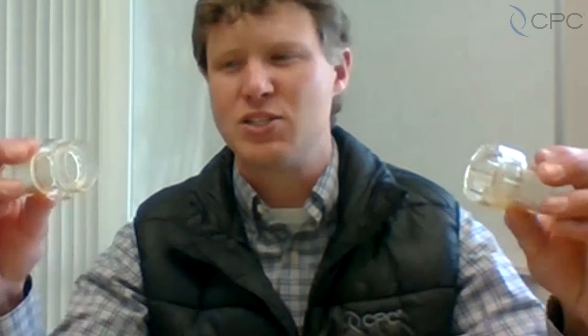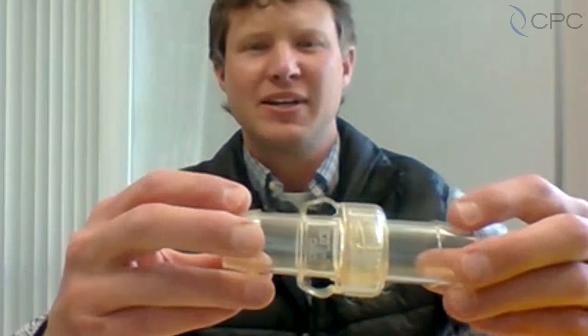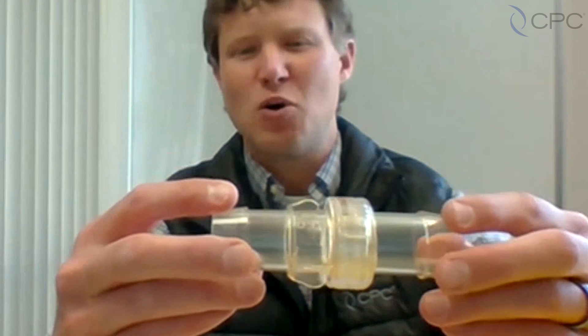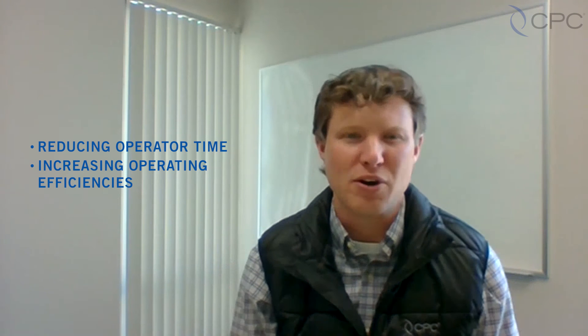The connection process of the MPU is as simple as a quick quarter turn, enabling rapid fill and emptying of bioprocessing containers, reducing operator time, and increasing operational efficiencies throughout your facility.